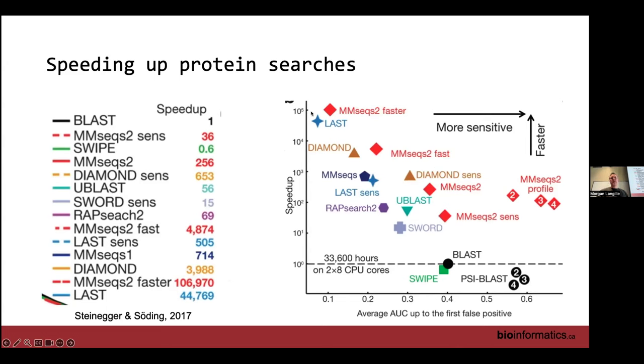Yeah, so it's great. A lot of systems will show it this way. They'll say you upload your metagenome, your one metagenome, and you can describe it. But obviously we often want to compare more than one, or more than five, at a time. So it just doesn't work quite well. That's why MEGAN is a nice system, because it disconnects the hardcore similarity searching from the visualization, which is still somewhat computationally intensive, just not as bad.